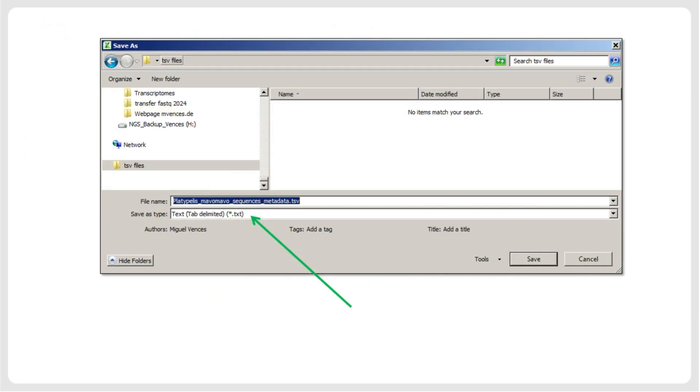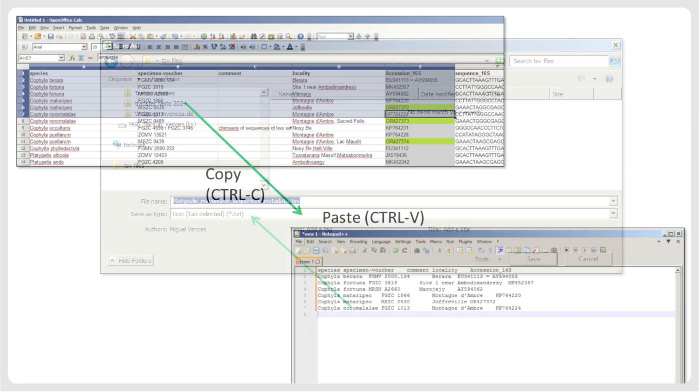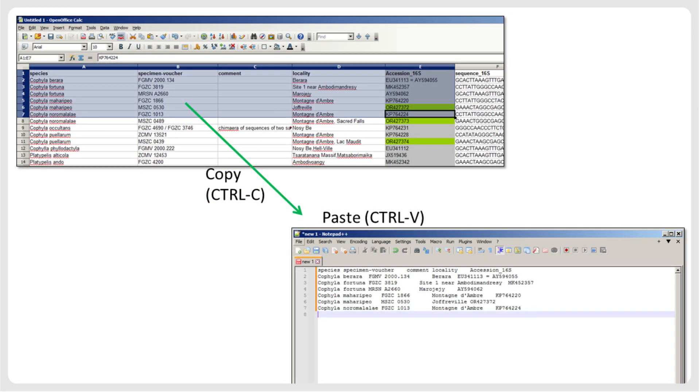In spreadsheet editors, you typically have the option to save or export your data in this format. Alternatively, if you just copy your spreadsheet or a section of it from the spreadsheet editor, and then paste it into a text editor, the text will automatically be tab-delimited and can be saved as TSV. We recommend saving the files with the TSV extension, so that they are automatically recognized by iTaxoTools programs.